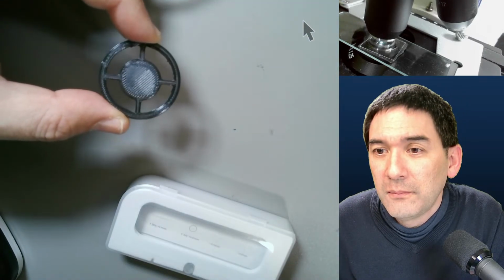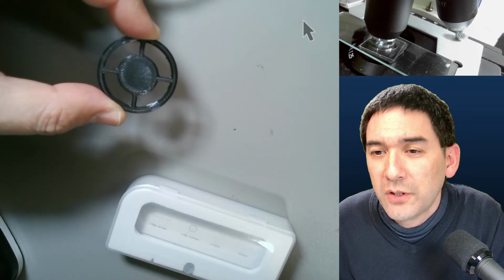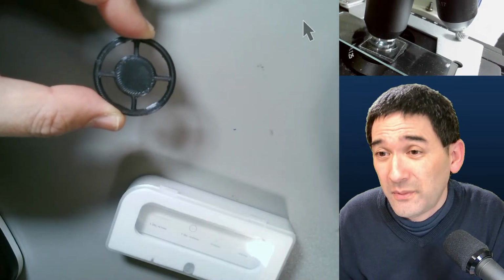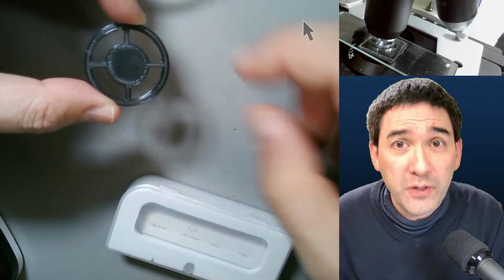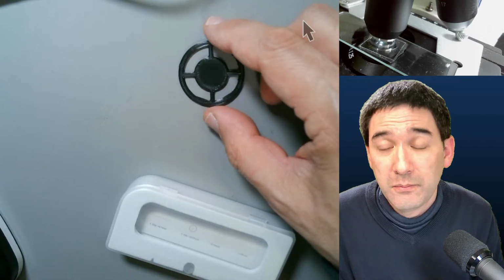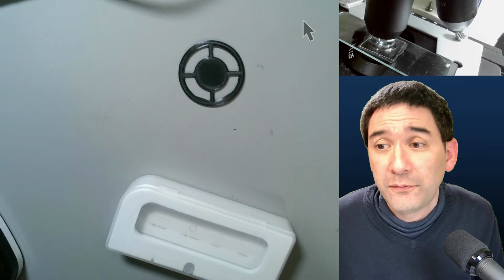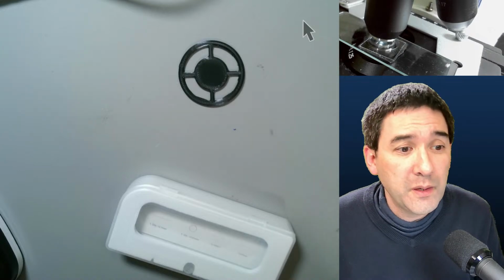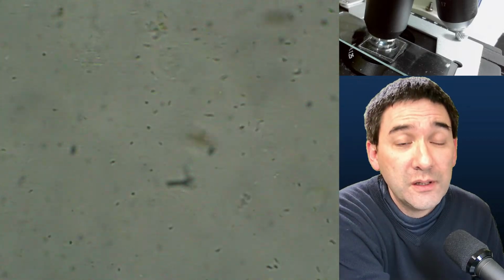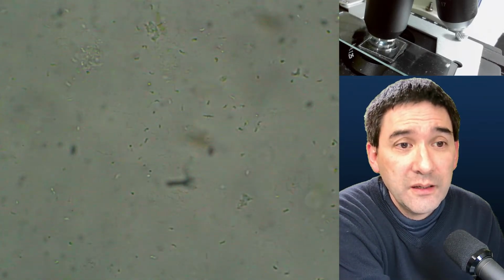So, have you seen a spiraled oval shaped eukaryote? I've seen so many of them. Spiral shaped. Well, many spirochetes are bacteria which are spiral shaped, but I see no reason why not asymmetric ones. There are plenty. There are lots of single-celled microorganisms around that have unique shapes. So that's basically again the bacteria.